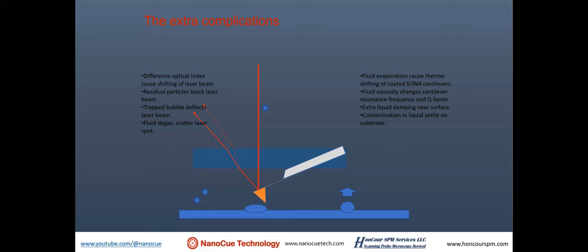What's accurate description is that the imaging principle did not change. The tip is touching the sample. The sample has to be on a solid. However, the solid surface of the sample could be exposed to liquid. So you're still imaging a solid sample, but the environment could be in the liquid.